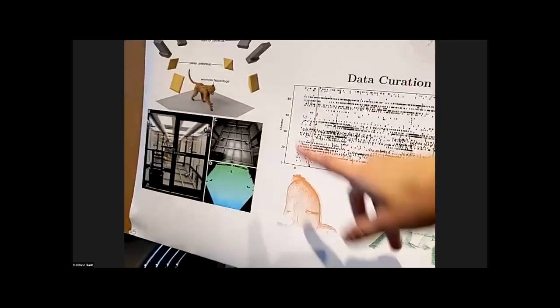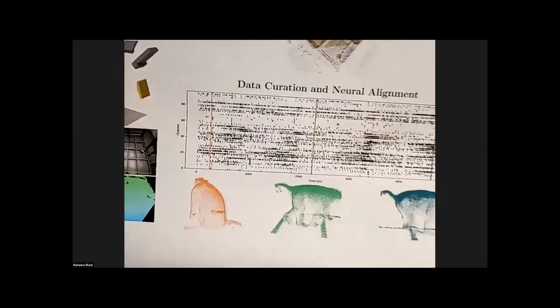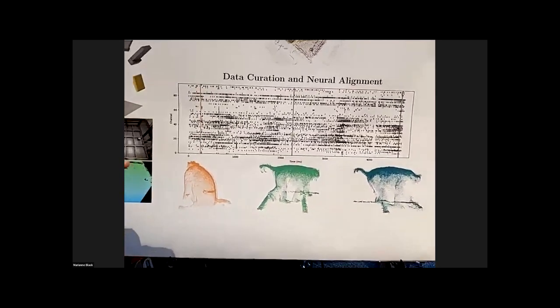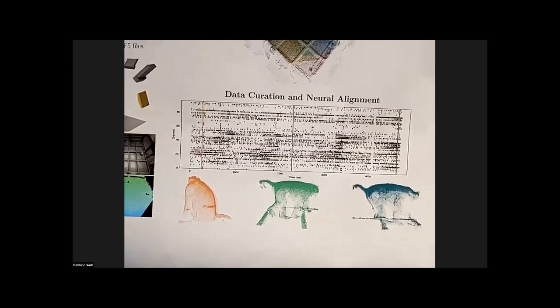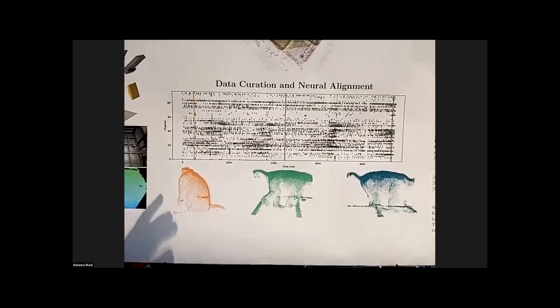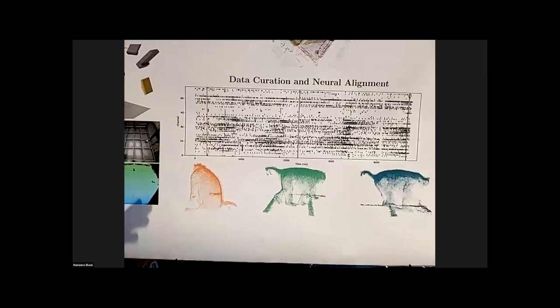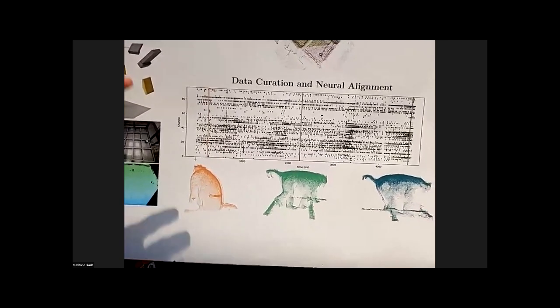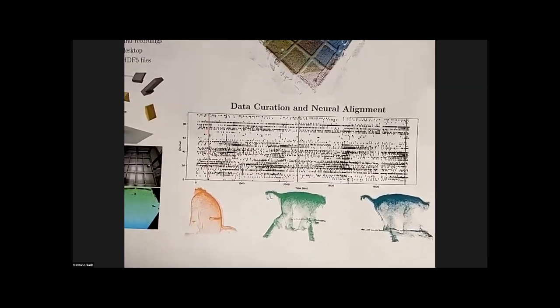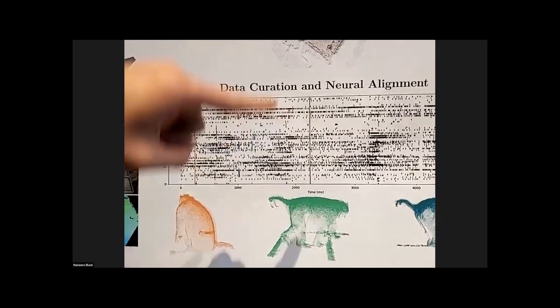This is super new to me and super out of my field. How do you even process this data? Sure. From the electrode array, you have an analog waveform, basically a voltage over time, right? If you filter it, then you can see what we call a spike train. Each time a neuron fires, it creates an action potential, which we can think of as a change in voltage. If you measure the voltage around the neuron, you'll see an increase and decrease, so it goes up and down.